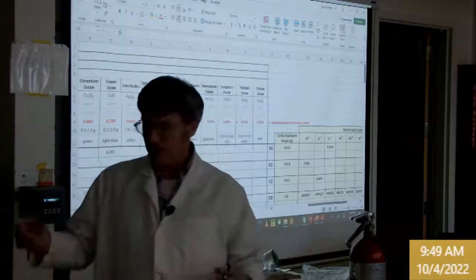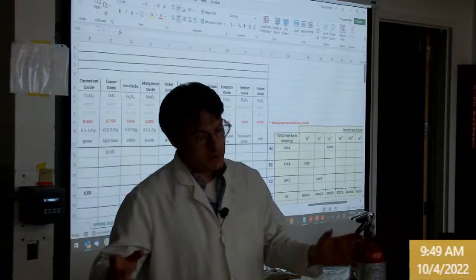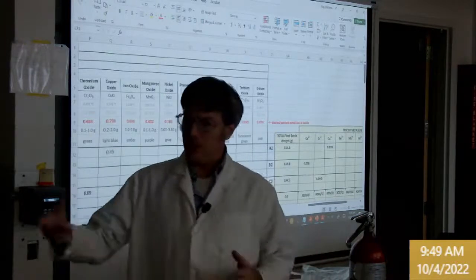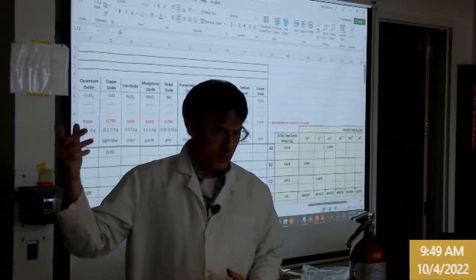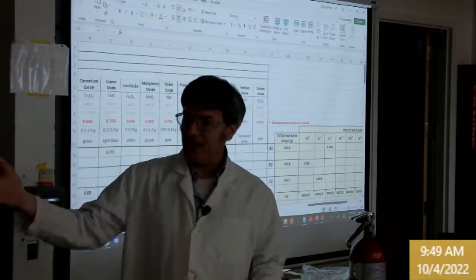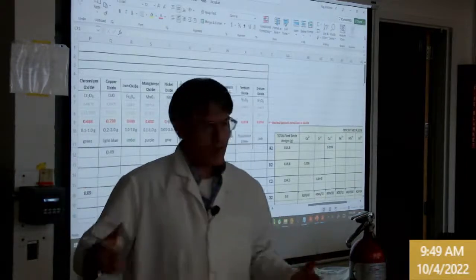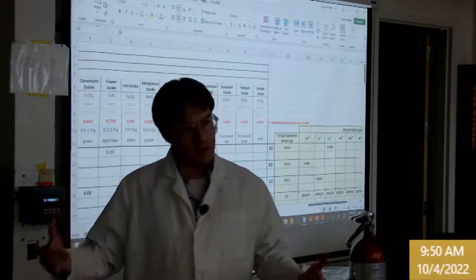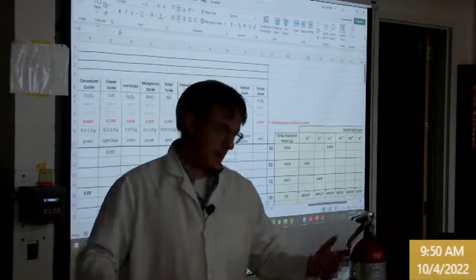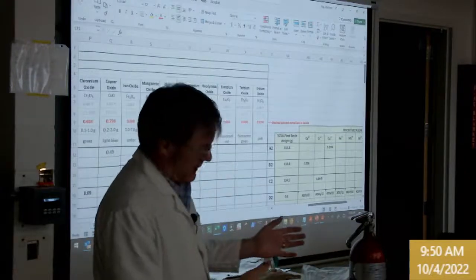I love this one. I think I may have already mentioned it. So in the event of a fire, we don't want you to fight the fire. We want you to calmly leave the building. Well, what if the fire is blocking the exit? We don't want you to fight the fire, we just want you to calmly exit the building. Well, what if a student is on fire? We don't want you to fight the fire, we just want you to calmly exit. So it's like a broken record, you know. So fire extinguisher training, it's really difficult.